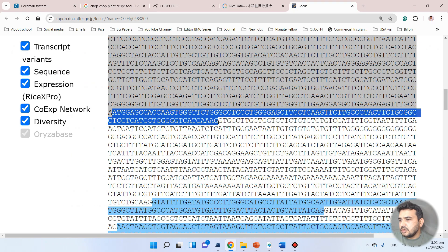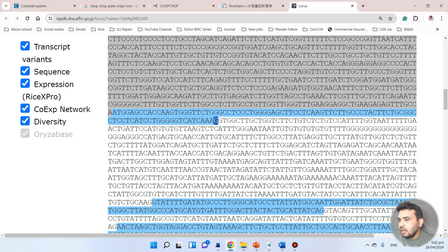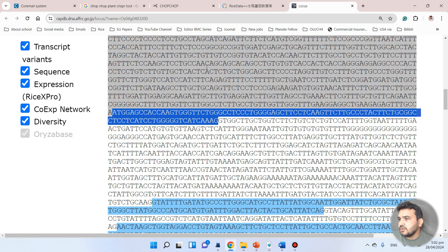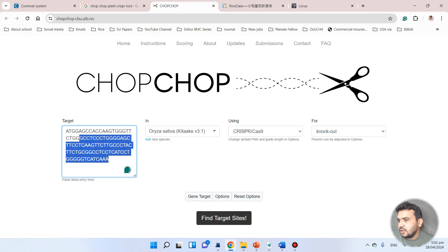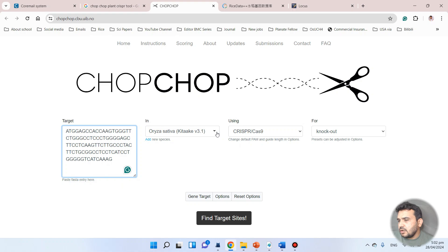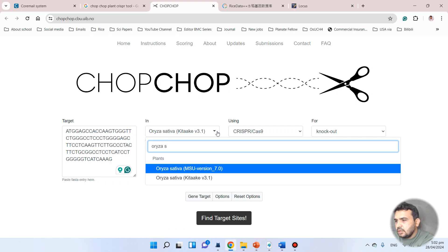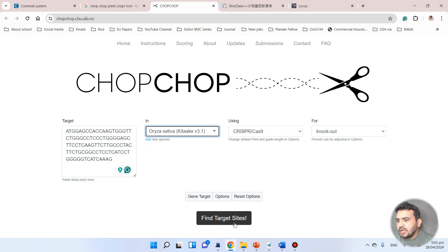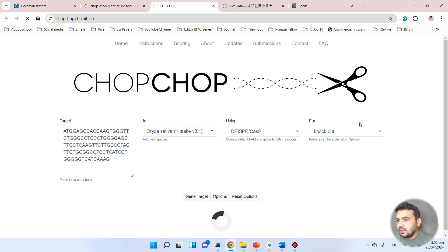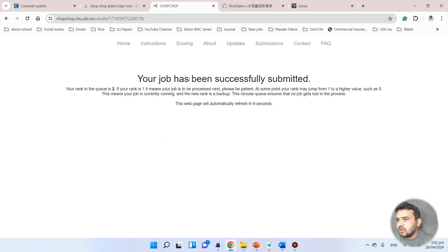This is the first exon, and we want to design our guide RNA from this first exon. We simply copy this sequence, go to CHOPCHOP, and paste it to design our guide RNA. From there we can select and search our species — Oryza sativa, specifically the Koshihikari cultivar, since it is fully sequenced. We then click 'Find Target Site.' The job has been successfully submitted; our rank in the queue is two, so we wait a little.